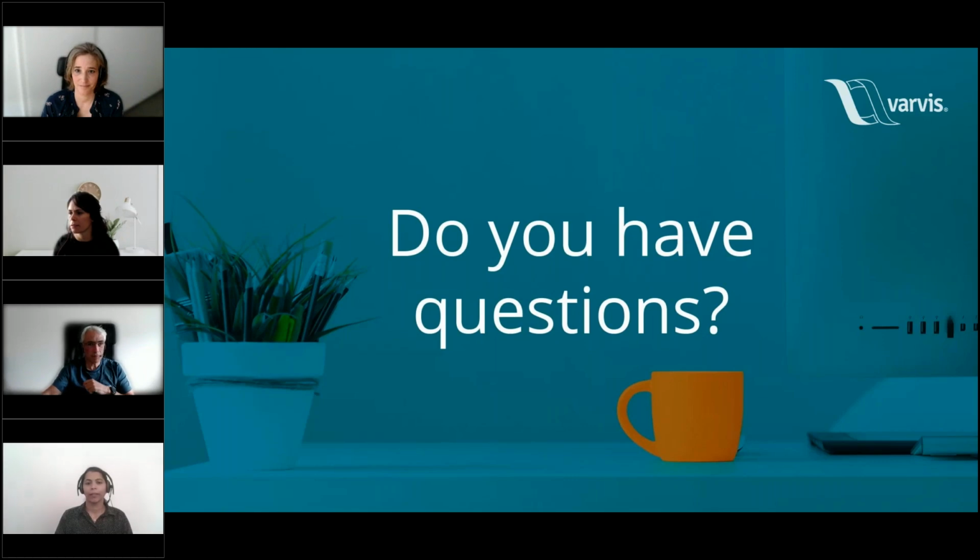Maybe I can start with one for Irene. It says, am I able to check a new gene in all patients to see if any of our patients carry variants in this gene? Yes, we have a search feature where users are able to search for a given gene or also a variant. So you would be able to search given specific details, and you would have results and the patients who are carrying them. This is not a problem.